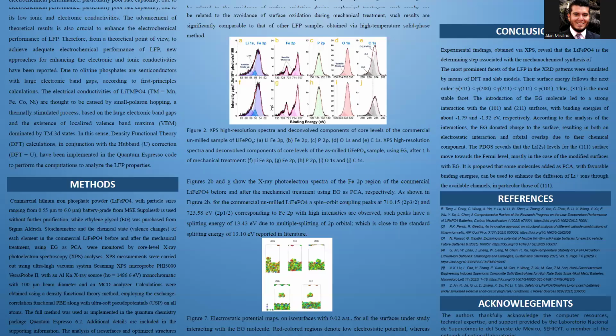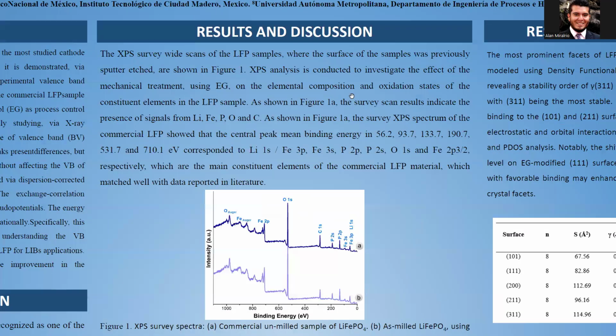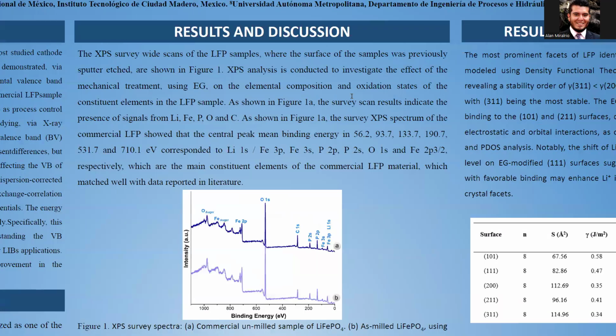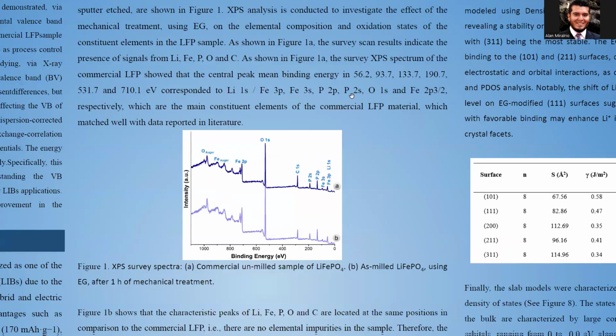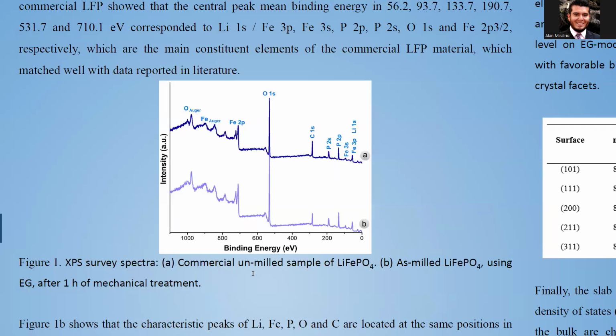In this case, we are trying to reproduce some experimental data by means of the theoretical approach. Here are the XPS survey wide scan results of the LFP samples, but also, as you can notice, it is possible to obtain the differences between the slab models and between the different surfaces, using ethylene glycol as a process control agent.